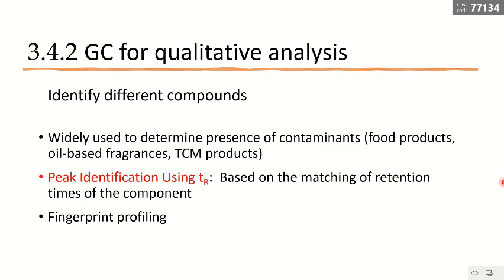If some of the peaks show the same retention time, and retention time is a very key word, then very likely, or in this subject we can assume it's true, they are the same compound. This concept will be very useful if we are going to do fingerprinting or profiling for complex samples.